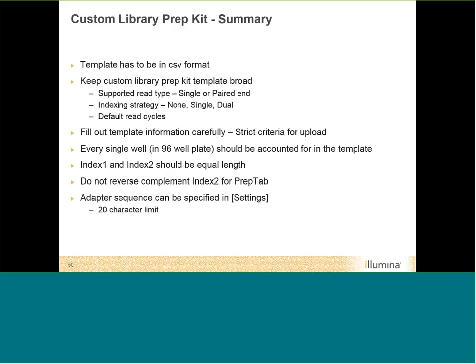So you want to fill out the template information carefully. The criteria is very, very strict for upload to work. And every single well should be accounted for in the template, in the 96 well plate. The index 1 and index 2 should be of equal length. And we'll talk more about reverse complementing. And the adapter sequences that are specified in settings have to be only 20 characters.